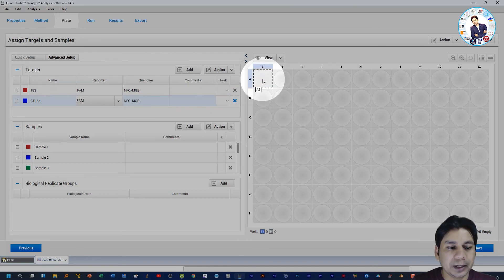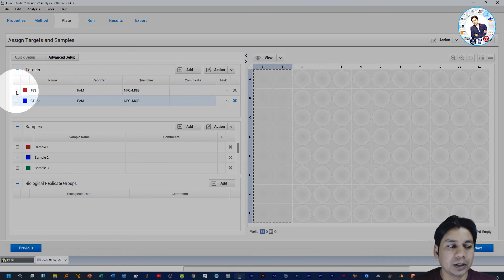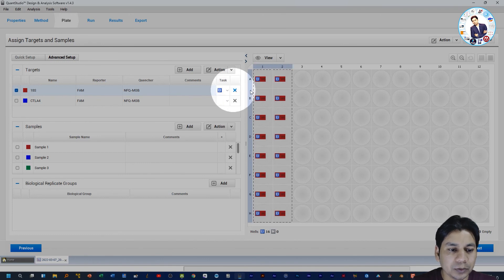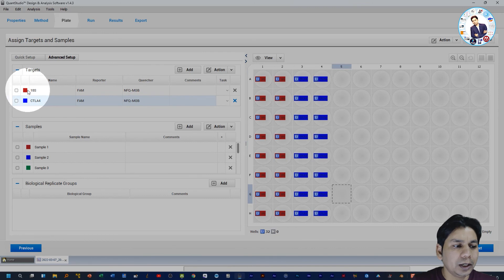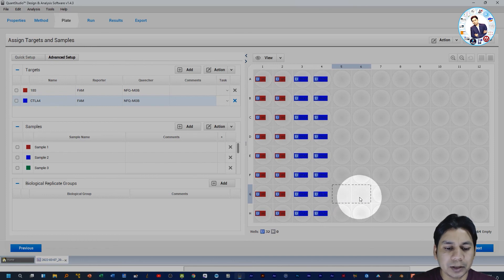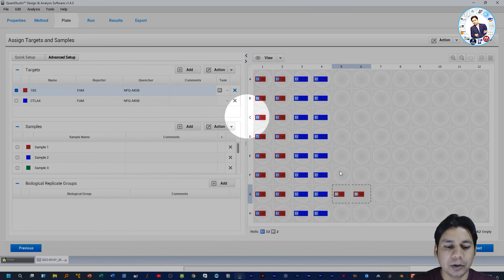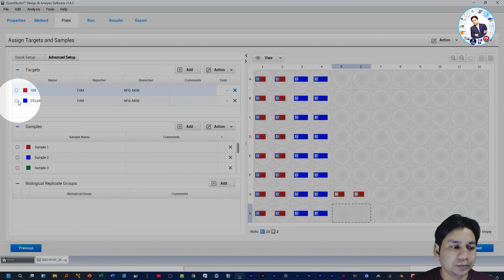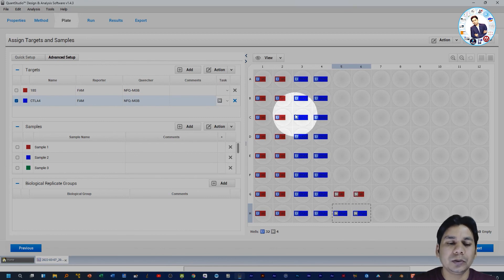After assigning target and sample names, assign them to your plate layout. Select the wells — I am selecting the first two columns for target 18S with task type Unknown. For the next two columns I assigned CTLA4. For the negative control wells, I used negative controls for both 18S and CTLA4 — select those wells and assign the target, then set the task type to Negative Control. In this way you can assign all your samples, targets, and negative controls in the plate layout.